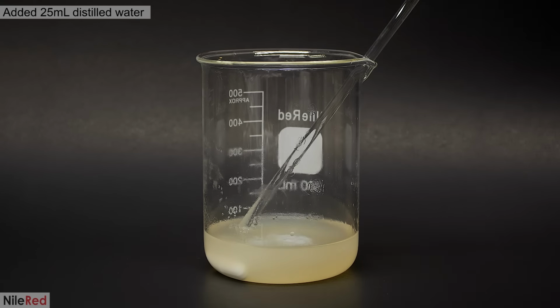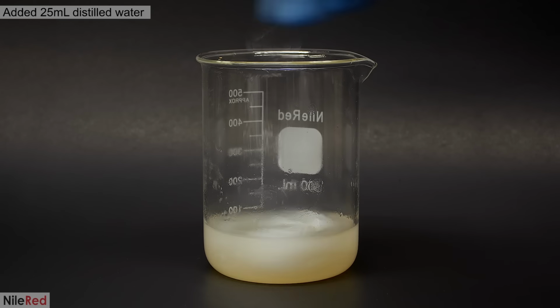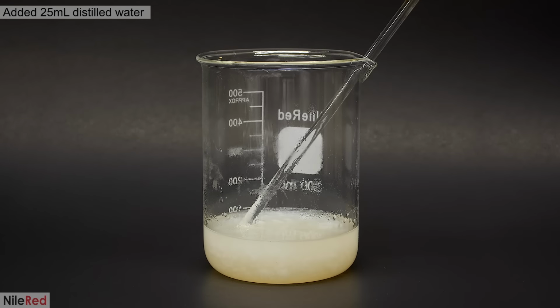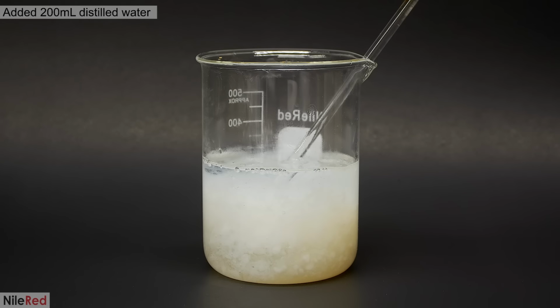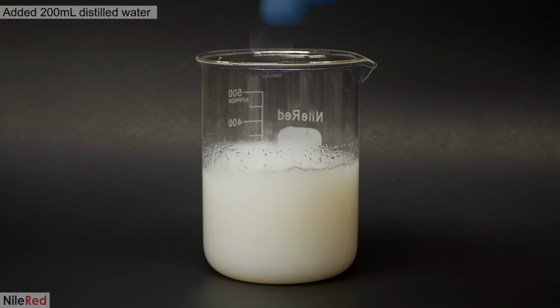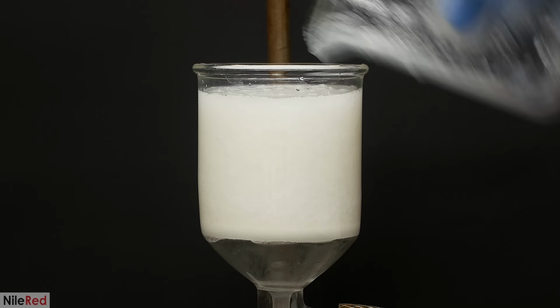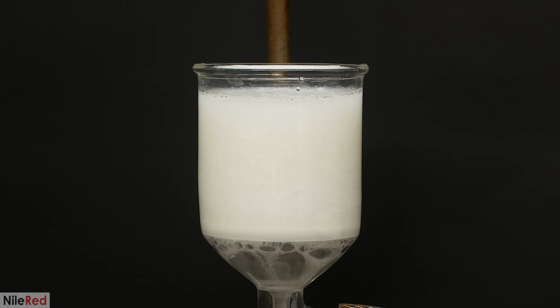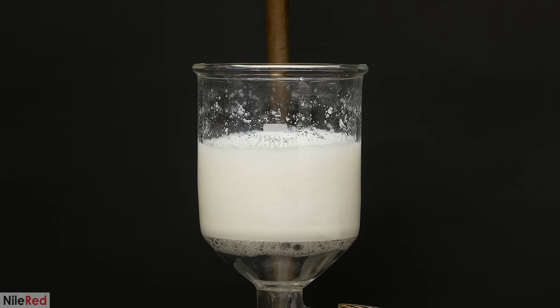I slowly mix in about 25 ml of distilled water, and a whole bunch of triacetate starts to appear. Then on top of this, I pour in 200 ml more to completely knock out the rest. I mix it up really well, and I let it sit for a couple minutes. To separate out the triacetate, I just dump it into my vacuum filter and I turn on the pump. All of the water is quickly pulled out, but unfortunately, this is the beginning of the kind of annoying part.